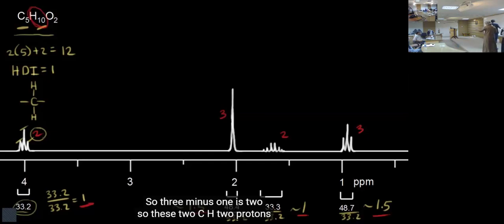Okay. He said there is a free proton that has no neighbor. It means you can put your carbon atom having no neighbor, meaning the carbon is next to another carbon or a heteroatom.